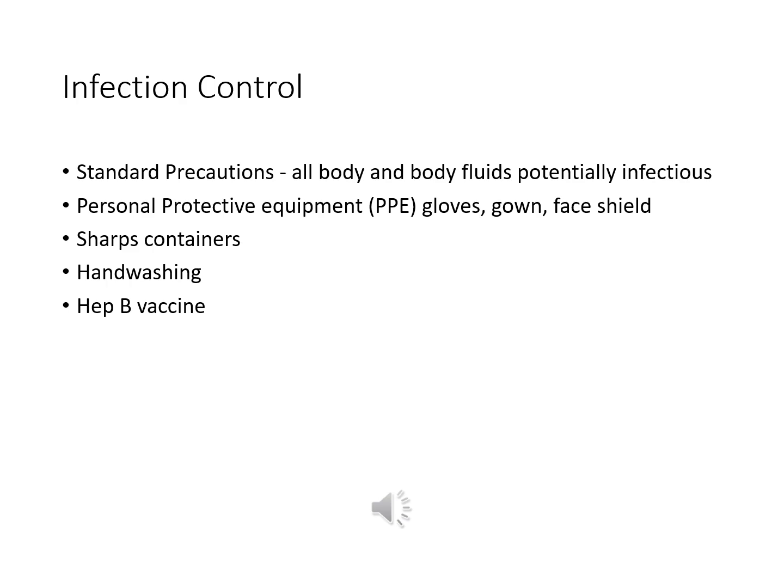Infection control in the lab is very important, as I'm sure you all know. With standard precautions, we consider all blood and bodily fluids potentially infectious, like we mentioned earlier. So when we're working with items in the lab, we always will don and doff the appropriate PPE, gloves and gown. Those are almost always given. Sometimes they'll be given goggles or face shields too. It really depends on what you're working with.